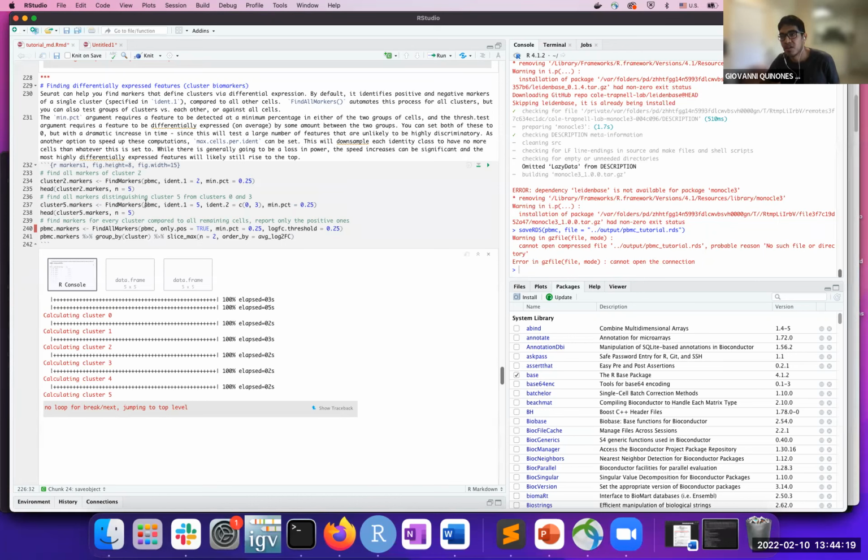As you can see, it's just one line of code. So we're not going to go through too much detail. We're going to look at the output, so you know what numbers we're getting, what is going on. But other than that, we cannot really expand too much on the topic of differential gene expression.